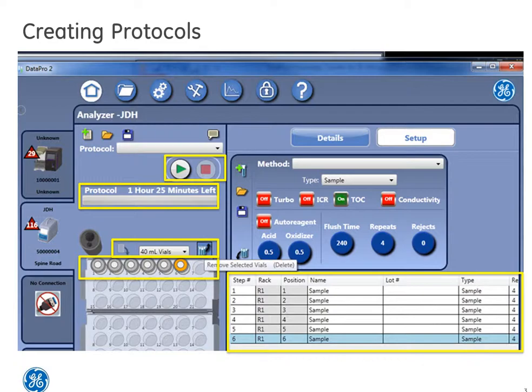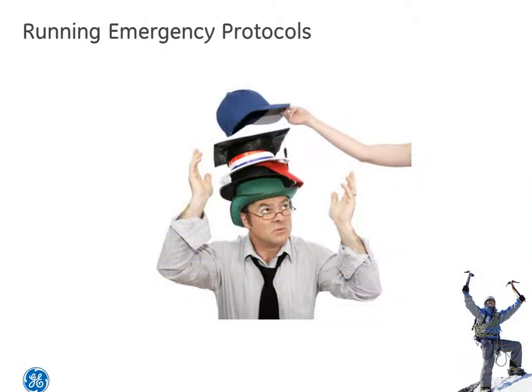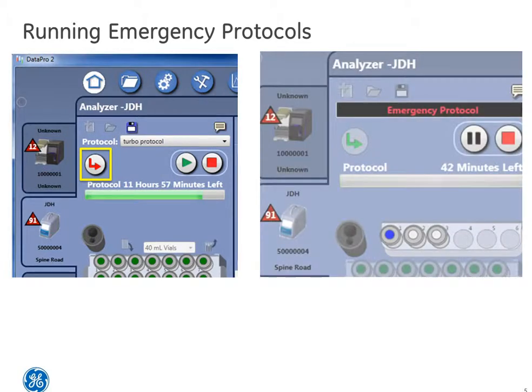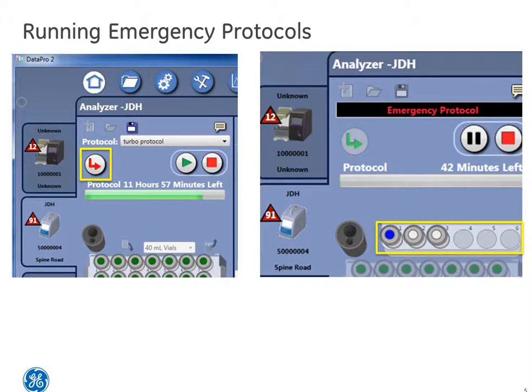But what if you have an emergency? You know those times when non-routine samples are dropped off and you have an 11-hour protocol running? That's not a problem for DataPro2. Emergency protocols can be accessed by clicking the red emergency protocol button. Then load your emergency vial rack and select the emergency icon again — it will switch to green and DataPro2 will indicate it is in emergency mode.